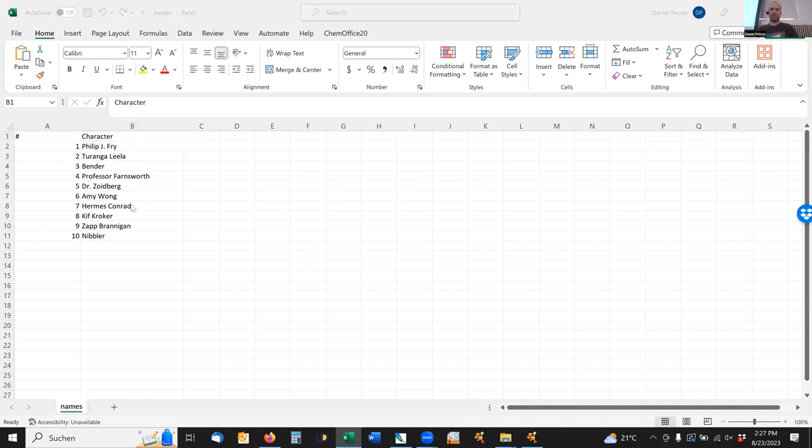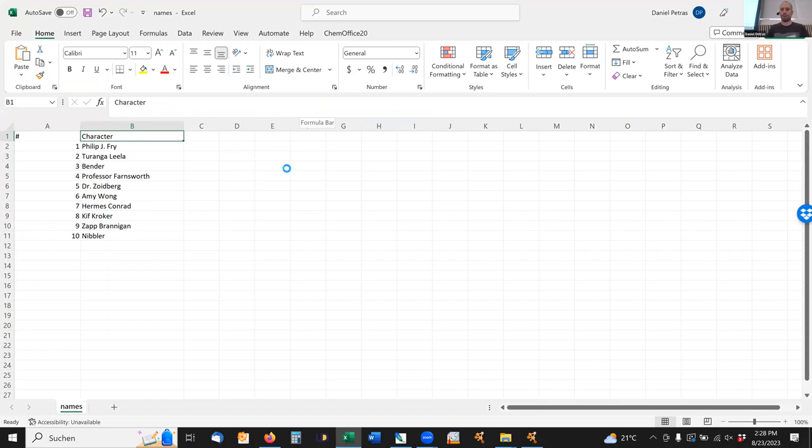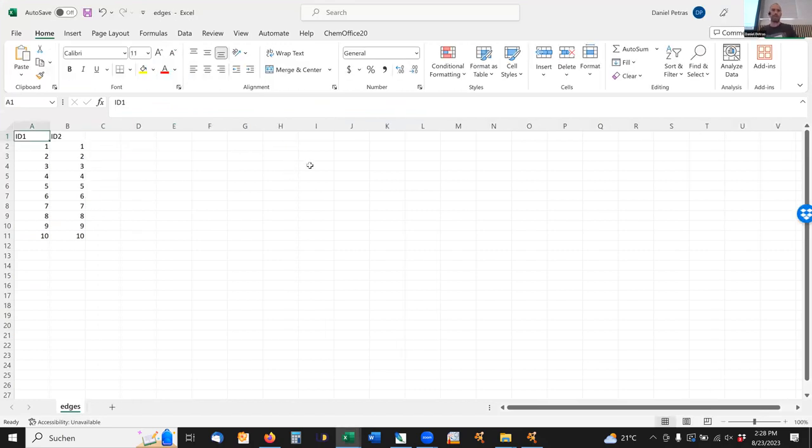And this would be a so-called edge file. Now if you think about what files we uploaded earlier to GNPS, there was already this IIN edges file, right? And this is exactly such a file that connects different features by their IIN identities. Also later, if you explore the GNPS output a little bit, you will find such edge files that build that. And the same way, I can open this in Excel or the editor, and I will just see the most simple way, self connections between node number 1 and 1, between 2 and 2, and so on.